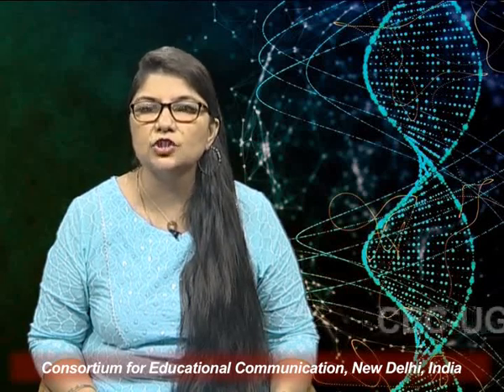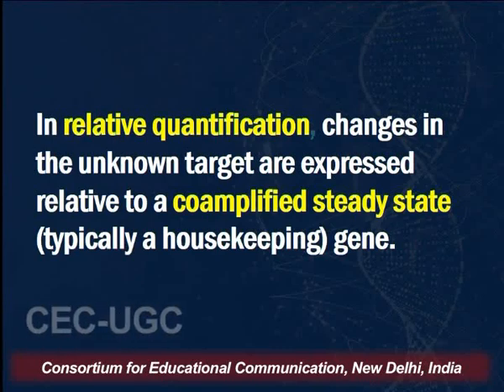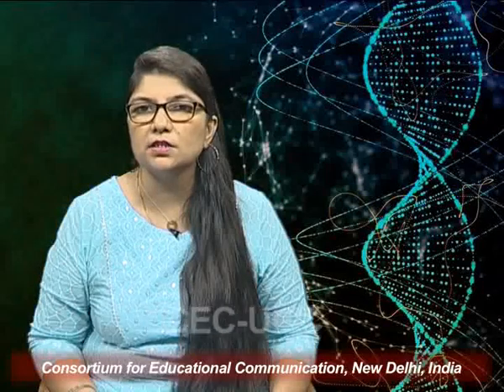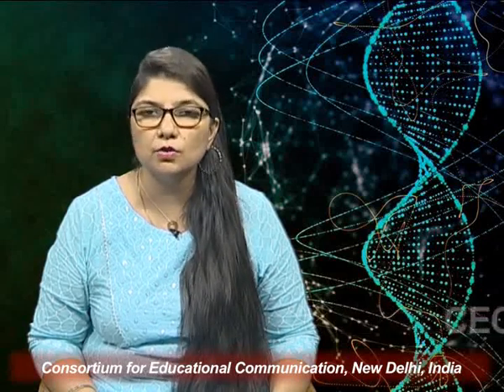So what happens in relative quantification is that the changes in the unknown target are expressed relative to a co-amplified steady state gene, typically called a housekeeping gene. For example, in prokaryotes, the 16S rRNA gene can be used. However, in a prokaryotic system, it is very difficult to get the steady state, but in a eukaryotic system, you get a lot of genes which are steady state genes.